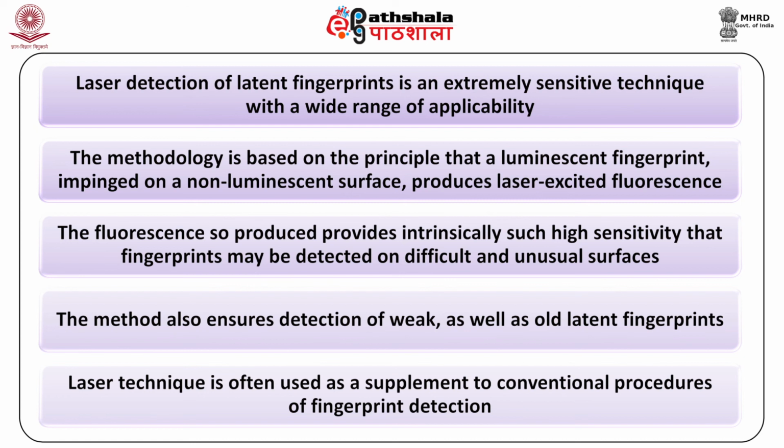The fluorescence so produced provides intrinsically such high sensitivity that fingerprints may be detected on difficult and unusual surfaces. The method also ensures detection of weak as well as old latent fingerprints. Laser technique is often used as a supplement to conventional procedures of fingerprint detection.